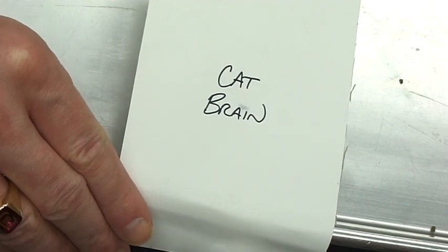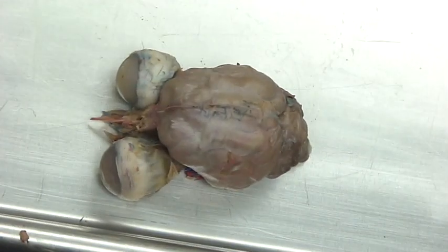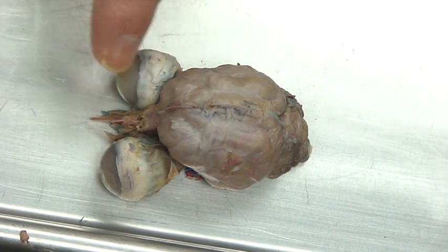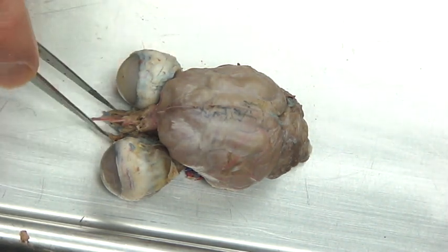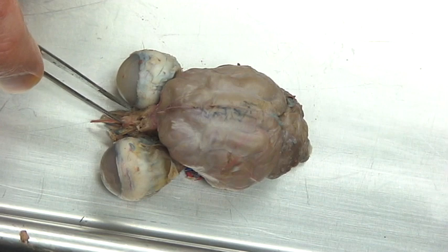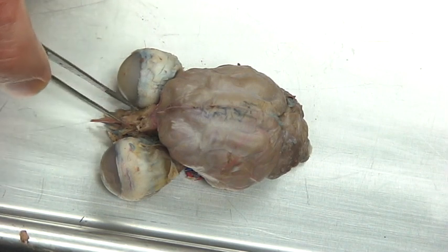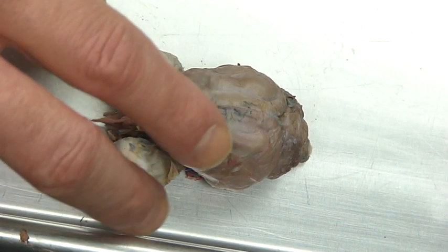Here we go with the cat brain. This is a little bit different view than what a lot of people would find, because I have kept the eyes and the optic nerves and everything else. Right here is where we would find the nose — you have the nasal bones that come down and divide in there. I'll be pulling those off to give you a view of what students would typically see when they harvest. This takes a little more time but it's kind of neat to see some things in place.